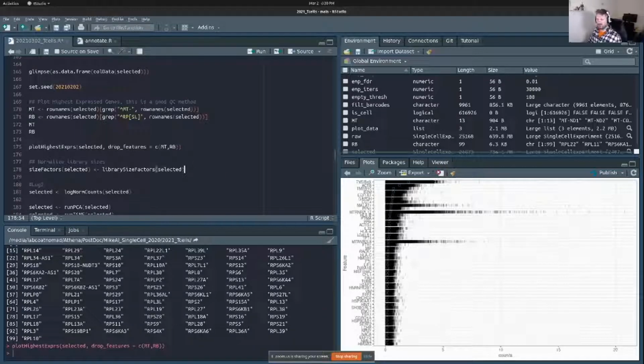So what we're going to do first is normalize the library. It's a type of scaling normalization. You define the library size as the total sum of counts across all genes in each cell. The expected value is assumed to scale with any cell-specific biases. This is the library size factor, if you're reading about it in publications and journals.